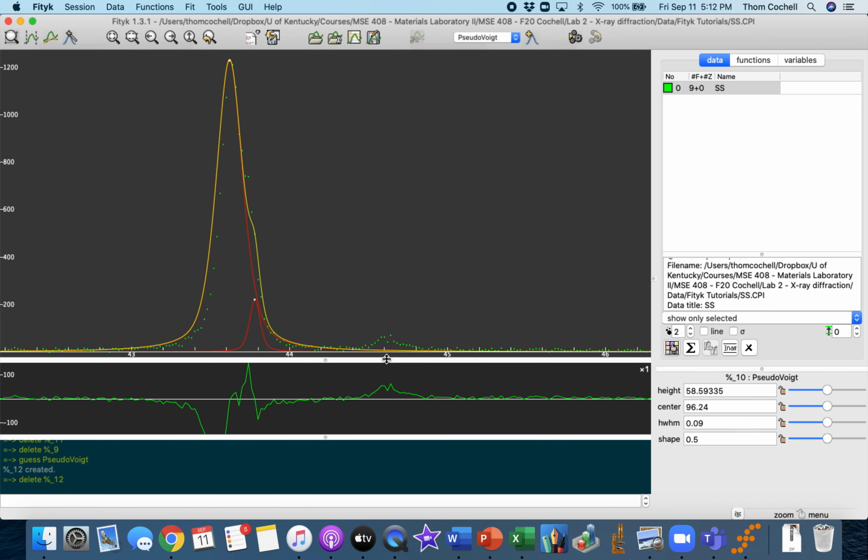So let's say that it didn't add one that you really think is a peak, like this one. We can auto add, but we can also manually add. That's what this add peak mode is all about. If I click and hold, and I'm still holding down the left mouse button, and if I move up, it makes a triangle that's larger. And if I go side to side, I can make the triangle's base larger. So I can adjust that by moving left to right.